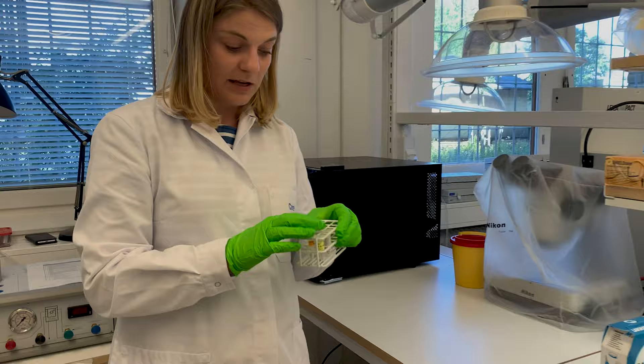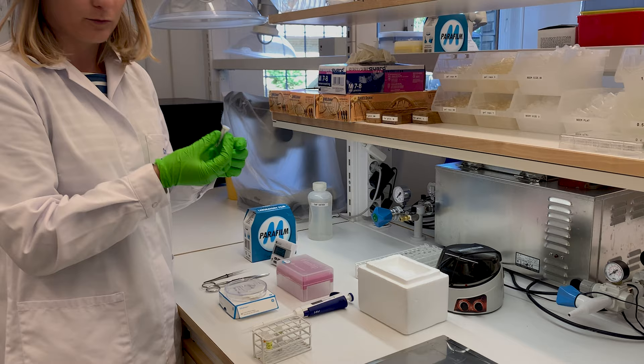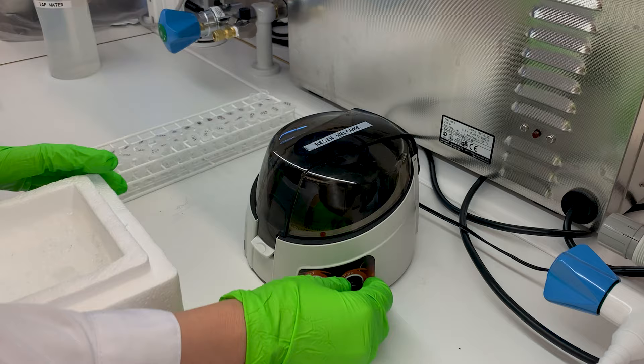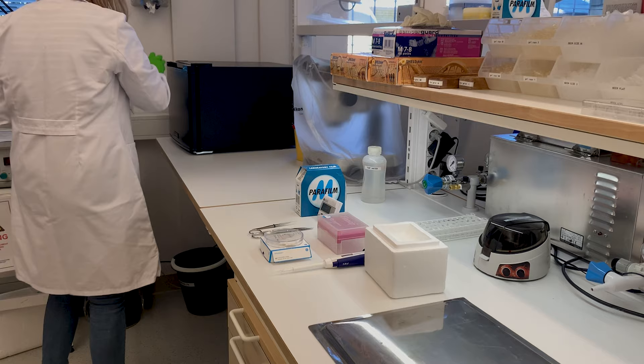What I can start with now is spinning down the solution, so that if there are any precipitants left after the previous user, they will end up at the bottom of the tube and we end up with a nice clear solution at the top. So here we have one and a half mil. I take a counterweight tube and spin this down for two minutes at maximum speed. I'll put the rest in the fridge so it's not getting exposed to light.